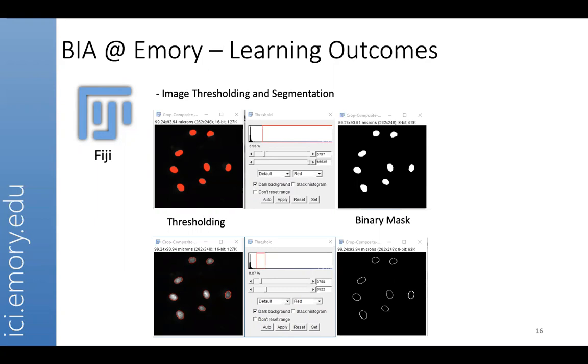So coming back to segmentation, right? Let's say, for example, you get your nuclei over here, and you want to identify or measure the fluorescence within these nuclei. Each of your images will have certain intensity values, and that's what you are looking at in this section right now. And you can select what intensity values you want to measure and create a mask out of it, right? So I want to select image intensity values which are between, let's say, 6,000 to about 65,000, right? That's what I'm selecting over here, and that's what this gray area is.